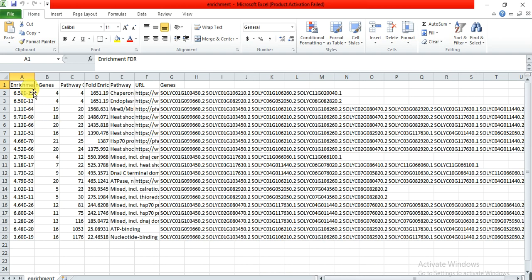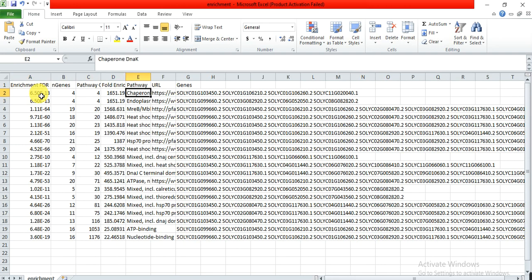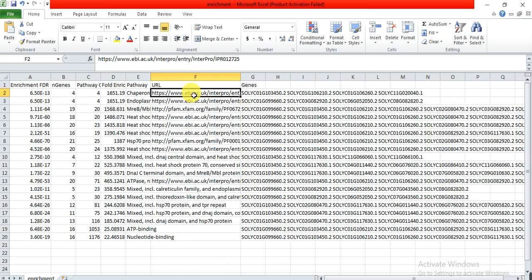Here is the information. This is the enrichment FDR value, and these are the genes, and this is the address of the database from where they have got the information about these genes.